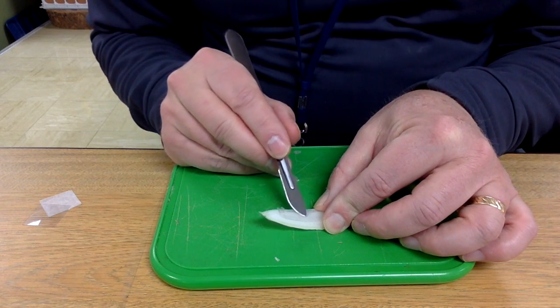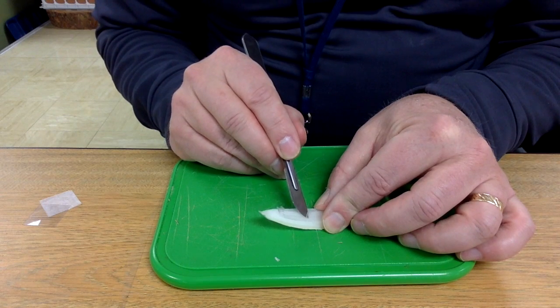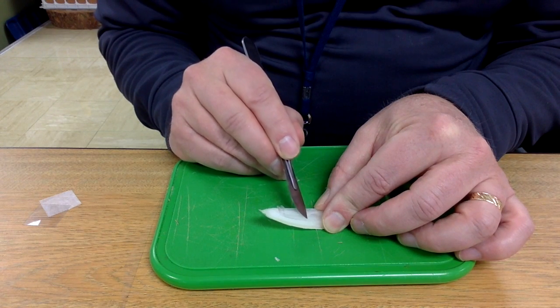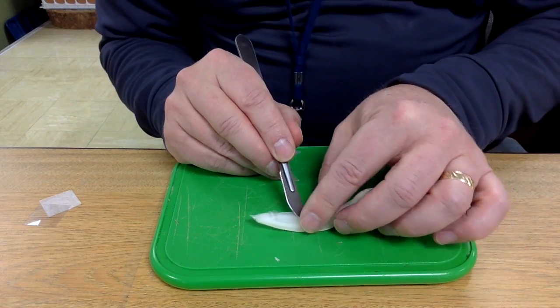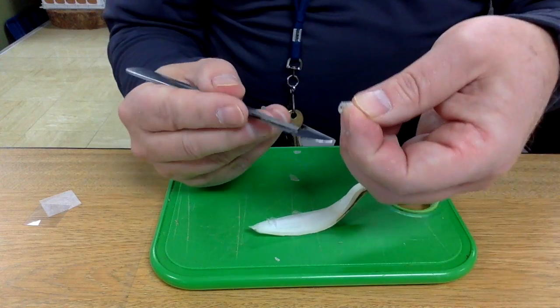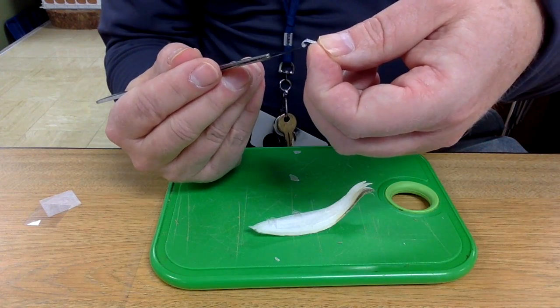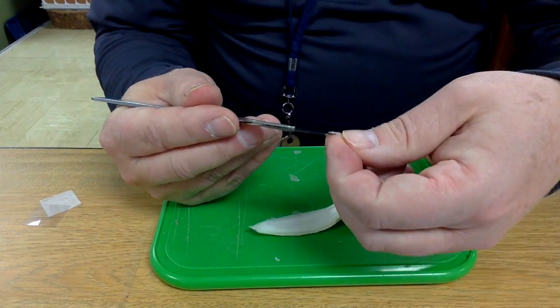If you're going to have an issue, this would probably be it. The onion does tend to come back and stick on itself, but just work across it — it's okay to get your finger in there a little bit to help pull that off. Then get it back onto the edge of the scalpel if you can.